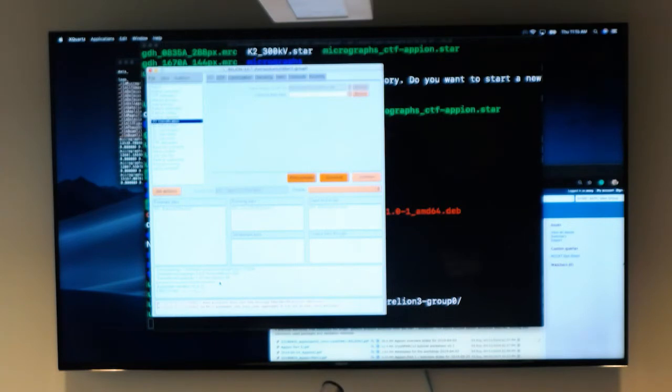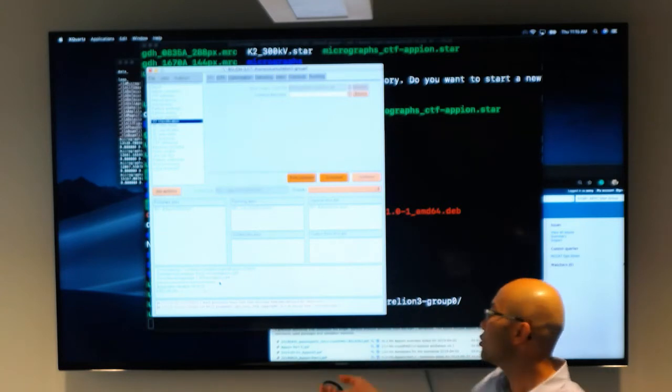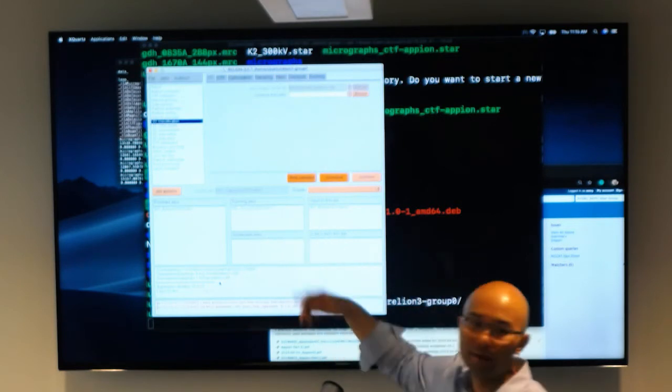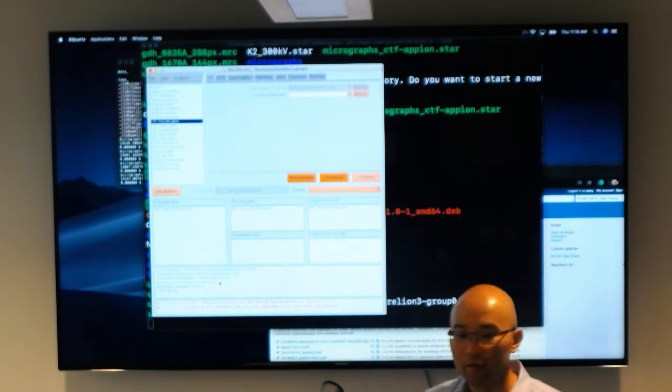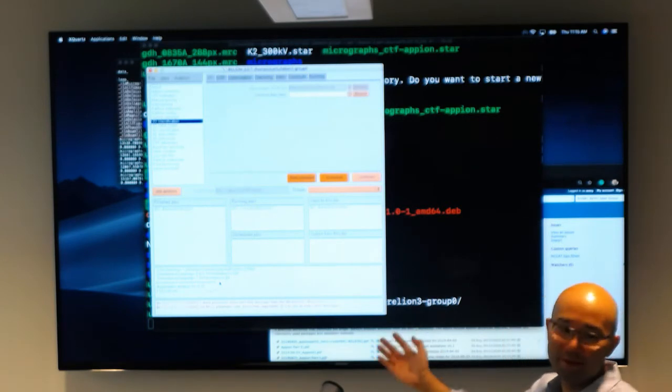Okay. How do you know it's actually running and not just stalled? You can click on it and it should update. It's a funny thing: when something is running, you'll see this mouse here, going towards the cheese. You can also go into the folder. If you go into your Appion folder, it's explicit, in this case class 2D. If you go into there, you can see the timestamp of the output as well. Another thing you can do, since everyone's running it interactively, is run top and see if there are any Relion processes running.